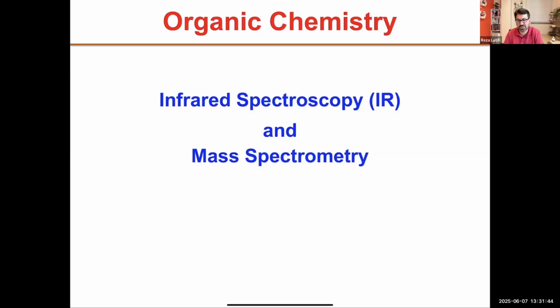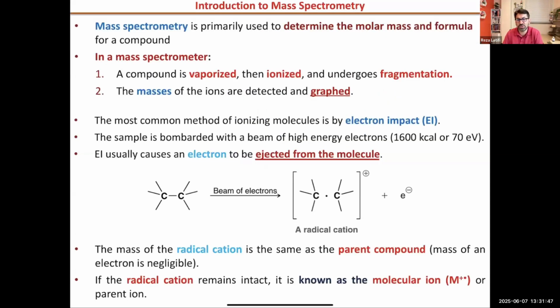In this lecture, I'm going to go through mass spectrometry, a technique that we use to find the molar mass of an unknown sample or a sample that we made inside the lab, and we want to have a confirmation that we got the sample.